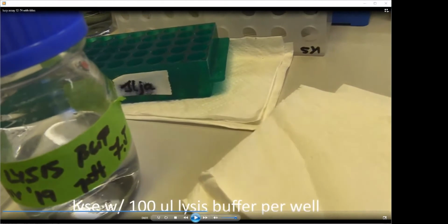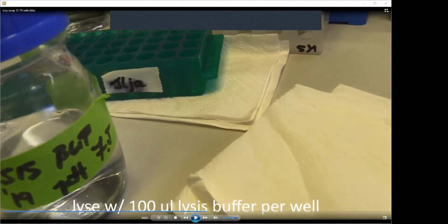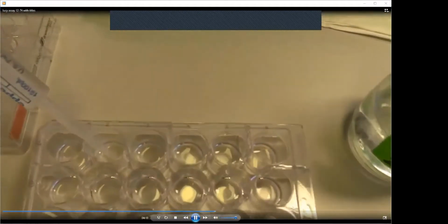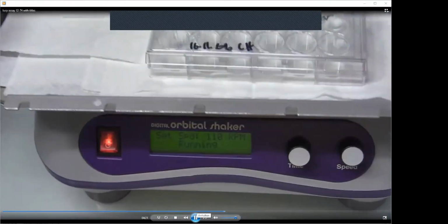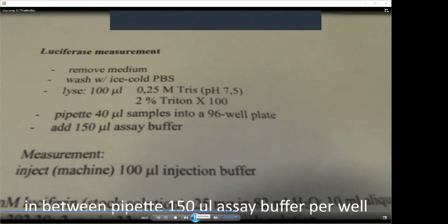lose your samples. Then lysis buffer is added, 100 microliters of this lysis buffer containing 2% Triton X100 detergent. This we do with this repeater pipette because it's fast and your cells will not dry out in the meantime. So everywhere is added 100 microliters of this lysis buffer. And then cells are lysed at room temperature, rotating on this shaker at least 5 minutes. It can be also longer. This depends on the type of cells.